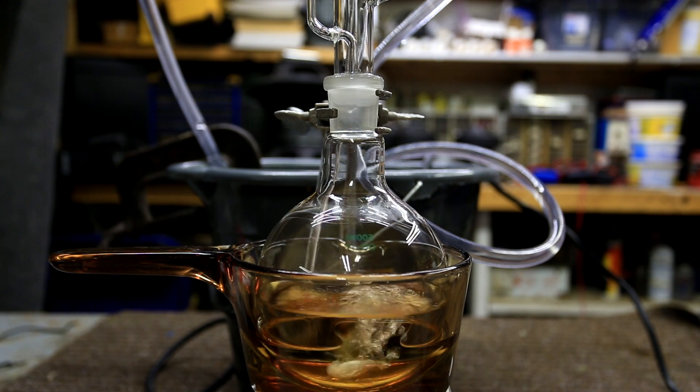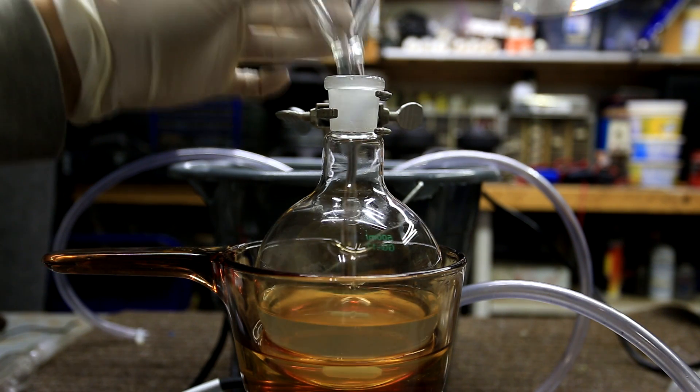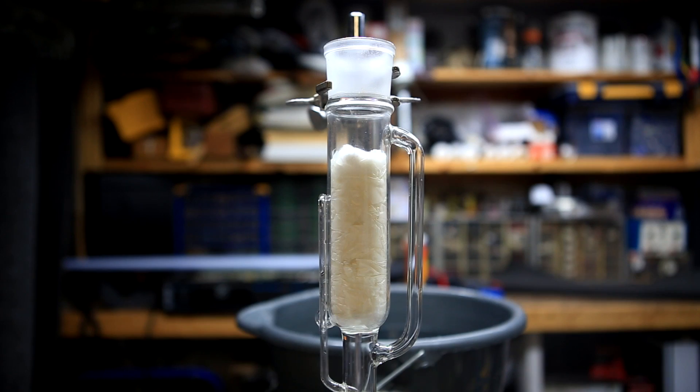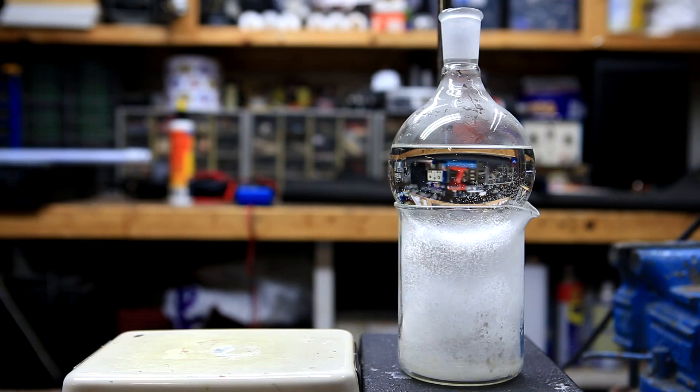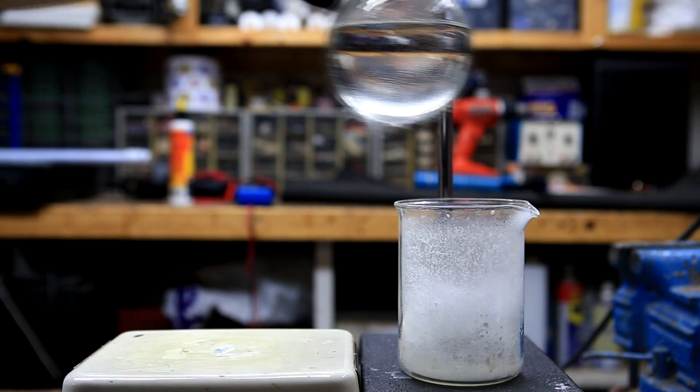PVC plastic is typically quite rigid and brittle when it doesn't contain a plasticizer. When it contains a plasticizer it becomes soft and malleable, and it can be used for things such as gloves. In this video we'll be extracting phthalate based plasticizers from vinyl gloves and then reacting it to form phthalic acid. The phthalic acid will then be converted into nearly pure phthalic anhydride by sublimation.